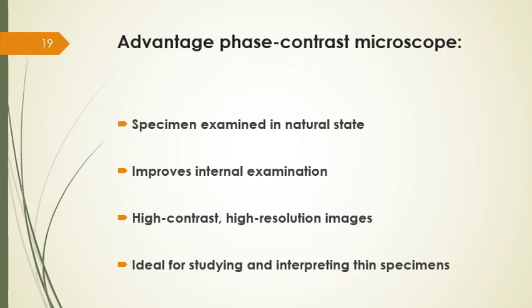So by this phase contrast microscope, a high contrast image with high resolution can be visualized, and this microscope is ideal for studying and interpreting very thin specimens that can't be visualized through a bright field microscope. So actually, by the involvement of this phase contrast microscope, the internal examination of any cell or specific structure may be improved.